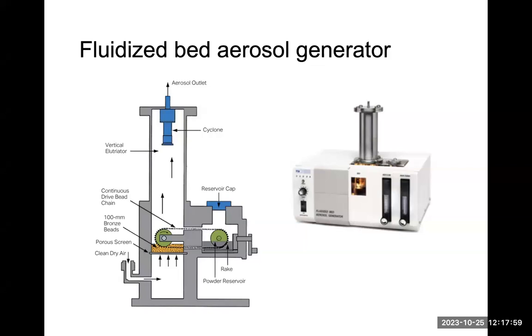It uses a fluidized bed with a lot of these beads here, and people introduce air into this volume, the fluidized bed, and it suspends all of these pre-cleaned bronze beads. These beads have a pretty large diameter, which means that by gravitational settling, they just settle down.